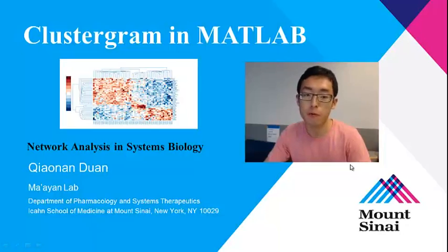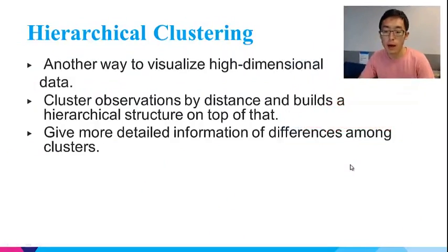In this lecture, I will show you how to make a clustergram in MATLAB. A hierarchical clustering is another way to visualize high-dimensional data, and it clusters observations by distance and builds a hierarchical structure on top of that. It gives more detailed information of differences among clusters. For example, it can tell you which genes contribute the most to the difference between two clusters.